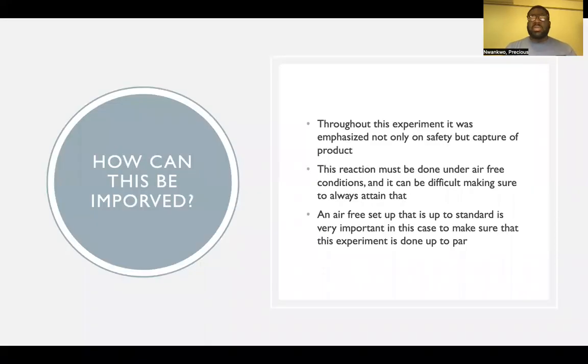So how can this overall experiment be improved? Throughout this experiment, it is emphasized not only for safety, but for capture of the product. We want to make sure that we get as much of that DCl gas into our IR gas cell as possible so that we get a really good readout.